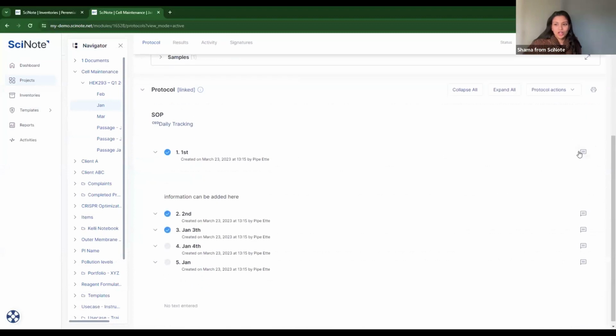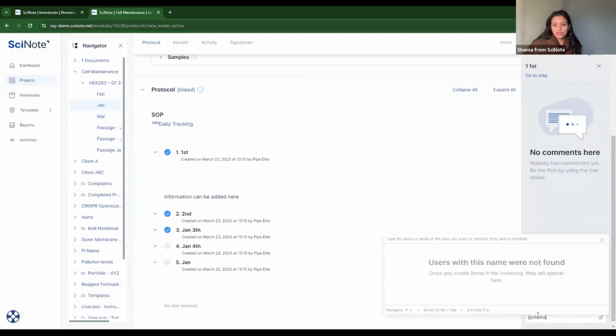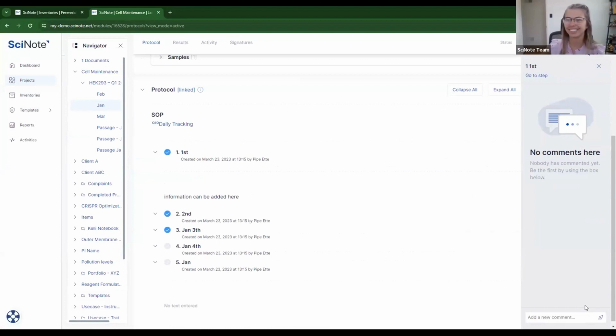Yeah, but if you wanted to comment at me, for example, and you wanted me to just confirm something for you, oh, I don't think I'm a part of that project, Kelly. You're not, yeah. But if one of my other users here, I can add them, and you could ask them to review a step or confirm the step or something like that. I think that works really well because I think it's all too easy to kind of freestyle in the lab when you're at the bench. So it just sort of limits that in a way.